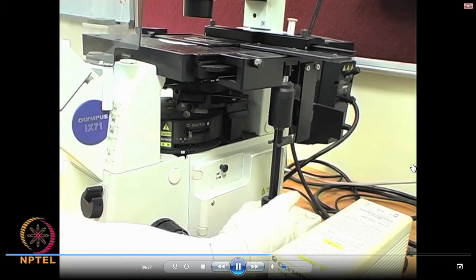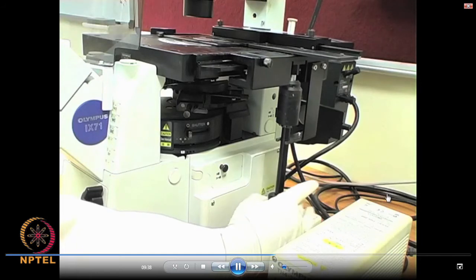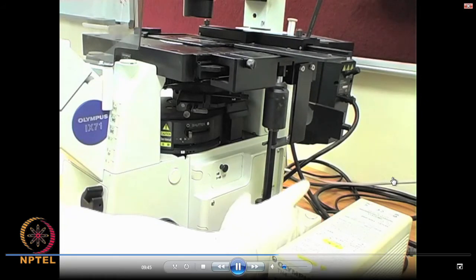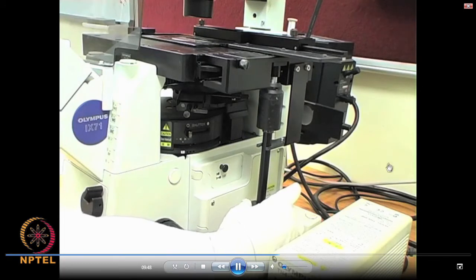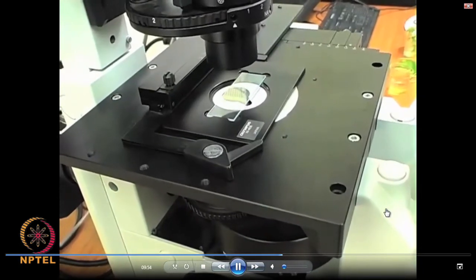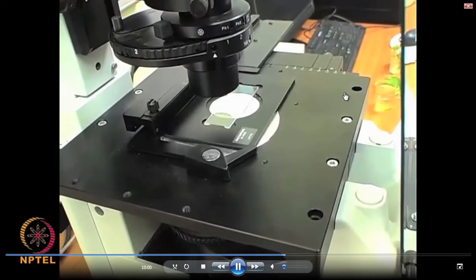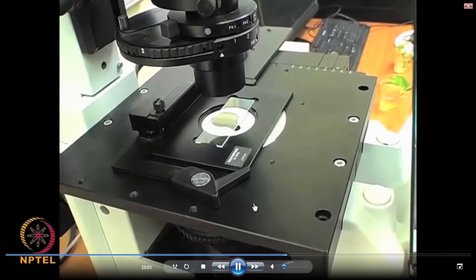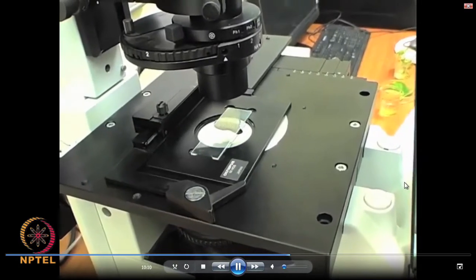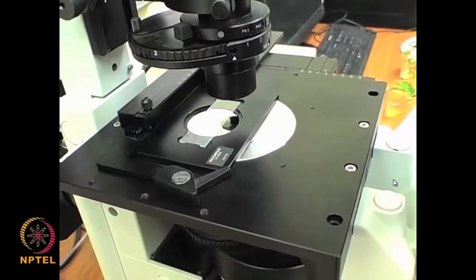So you should have an idea. This is done just to give you a feel as if you are actually in the laboratory operating this microscope. I will also give you the actual experiment so that you will have a complete understanding of the operation of this equipment. So again, the whole specimen stage is being adjusted. You can see that. This is another axis movement.